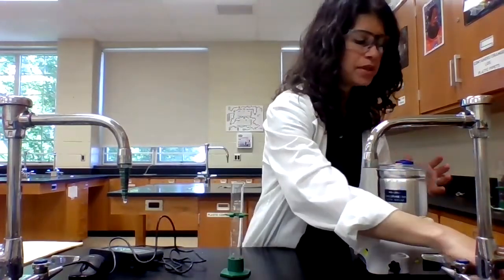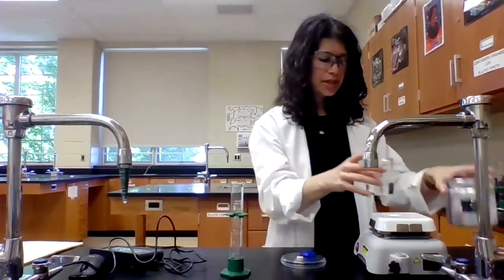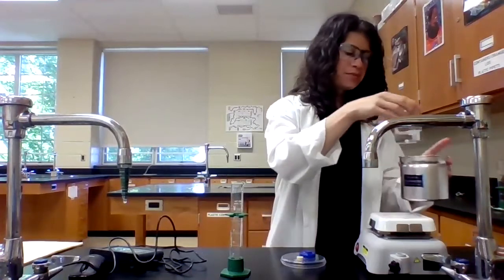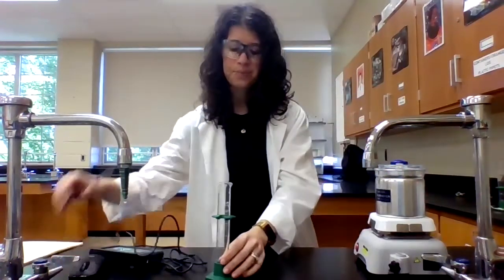So what I'm going to use is a magnetic stir bar. I'm going to put that in here as well. Just so you can see how this works, this is both a hot plate and a stir plate. So if I turn this on, you should see the little stir bar moving around there. That way I don't need to use a stir rod, because I can't keep it open. I want this to be closed.